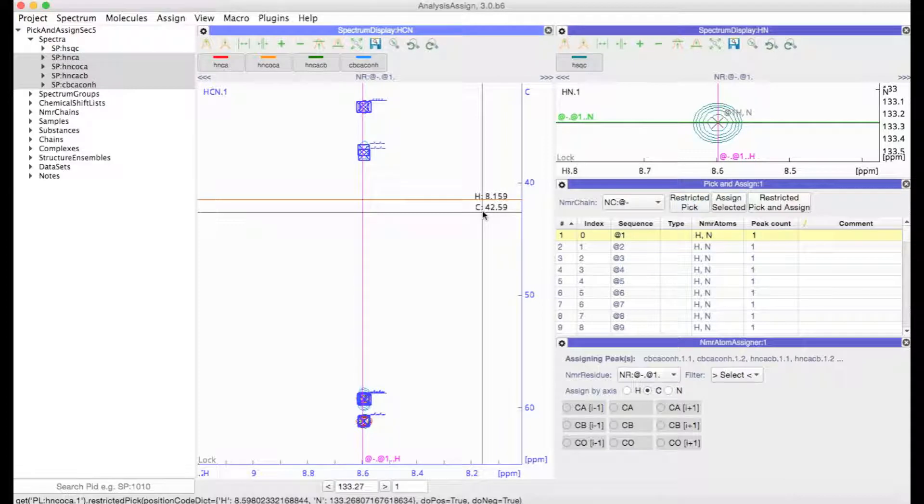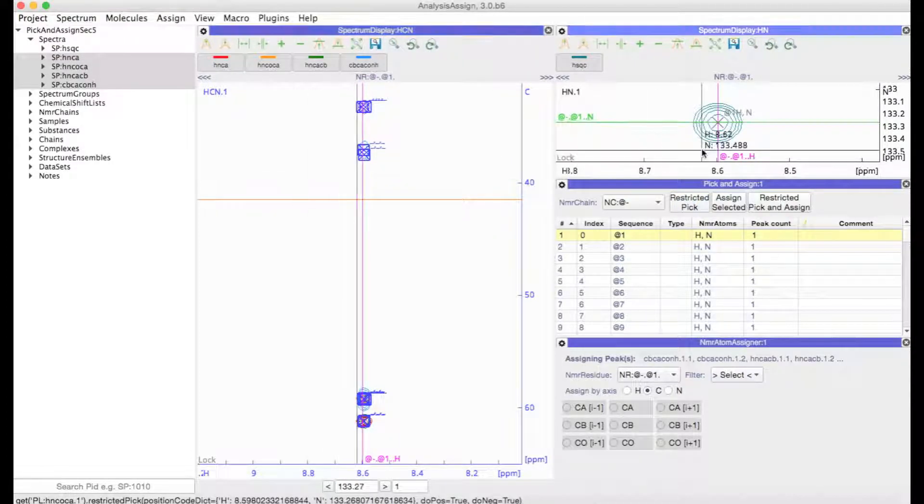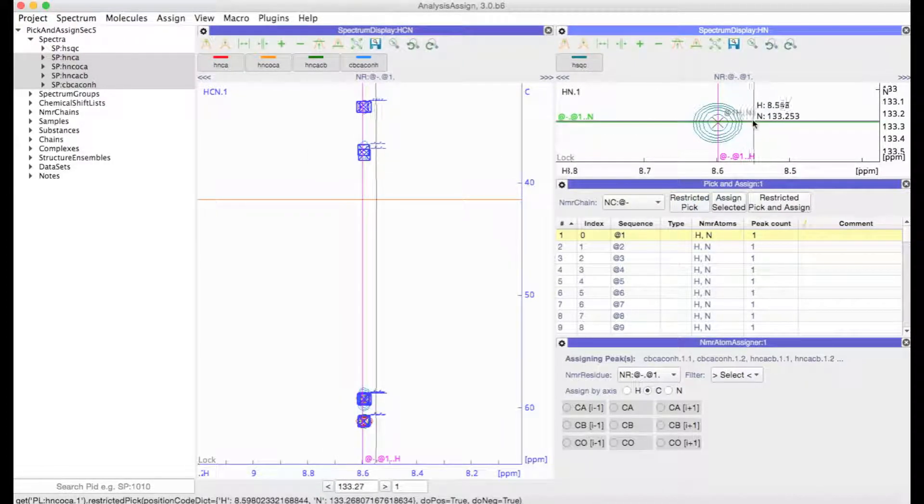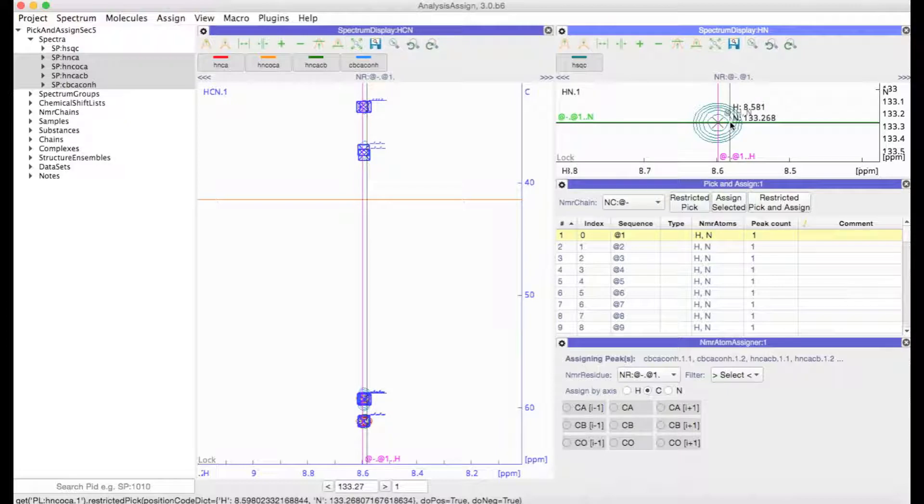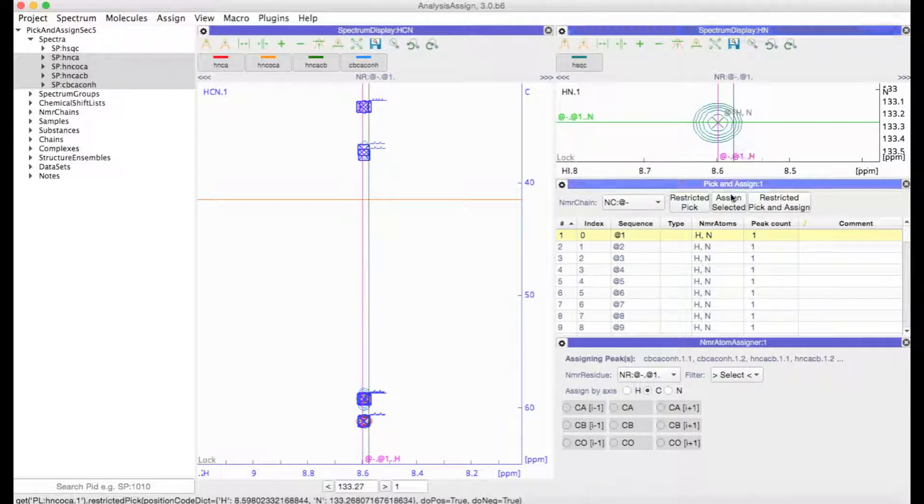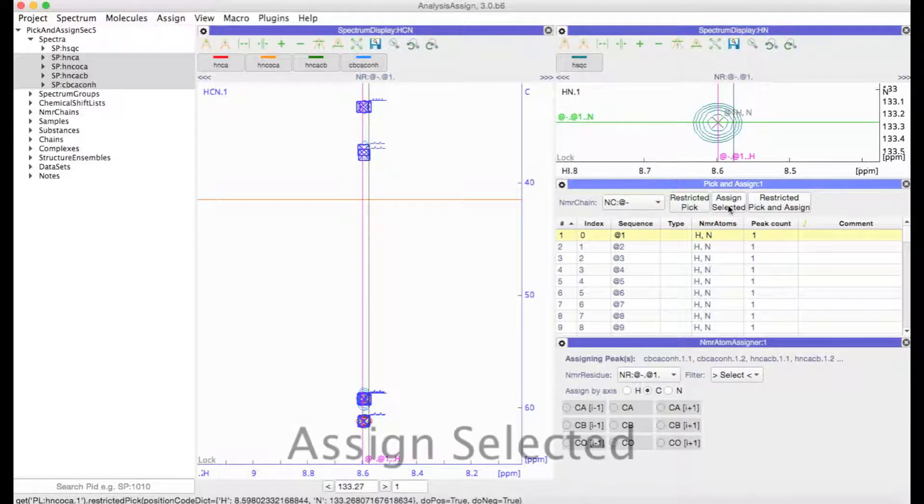The next step is to transfer the HN Atom Assignments from the HSQC over to the 3D spectra. You can do this by clicking on Assign Selected.